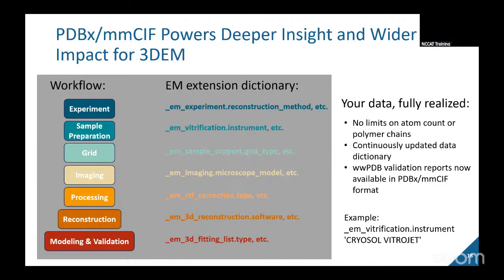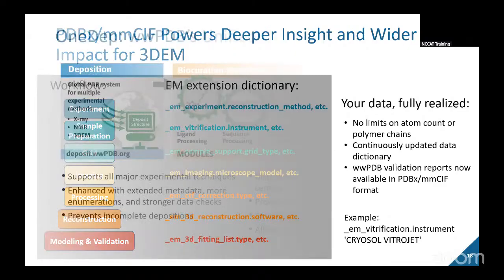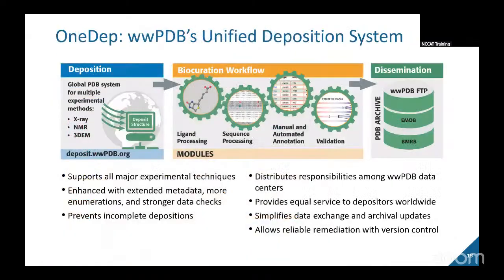Also, as new methods or technologies emerge, we can expand the dictionary to capture them. In this way, this data will be useful. And so hopefully, this makes you accepting and feel good about using the format, and you're wondering how to make the most of your structure in PDBx/mmCIF, which, by the way, you'll sometimes hear referred to as mmCIF as well. I may do it in the talk here.